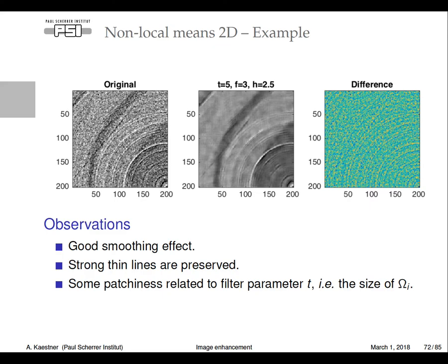You can really extract the noise very well from the original information. This is only done in 2D. That's why you still see the ring artifacts, but ring artifacts usually appear only on single slices. So if I had done this in 3D, probably the rings would have also disappeared.